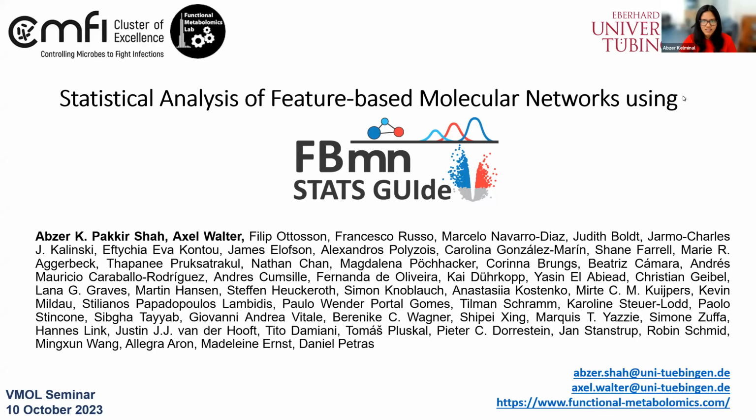Yeah, thank you. I guess everybody can hear me. Okay, cool. Thank you, Daniel, for the kind introduction. And hi, everybody. Today, Axel and I would like to present the FBMN-STATS guide that we've been working on since last year for the statistical analysis of feature-based molecular networking. As you can see here, it's not just a few people, but there are so many people whose work is involved, especially thanks to so many people from VMOL who contributed to this.